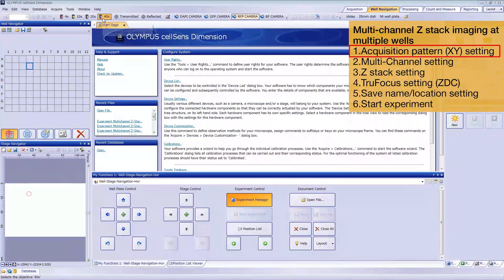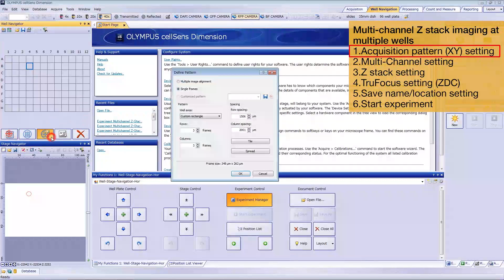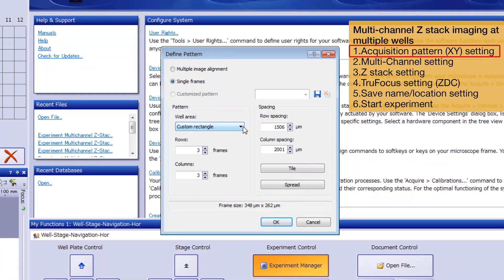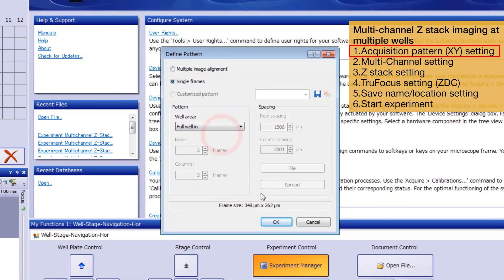Select the objective lens you're using for the acquisition. Then click Open a dialog box to define the current pattern. In this dialog box, you can define the XY acquisition coordinate pattern in each well. A variety of patterns are available. In this example, select Full Well In and then click OK.